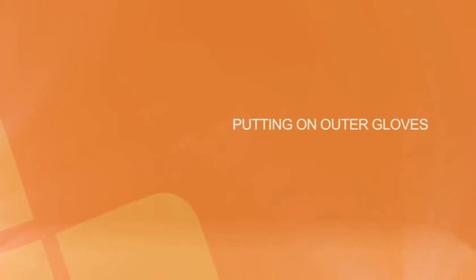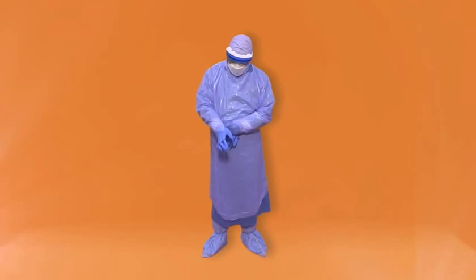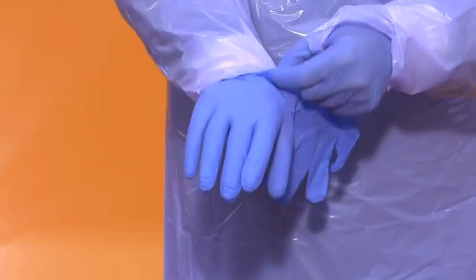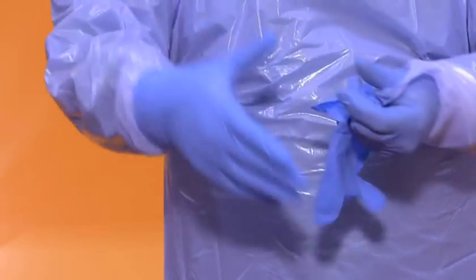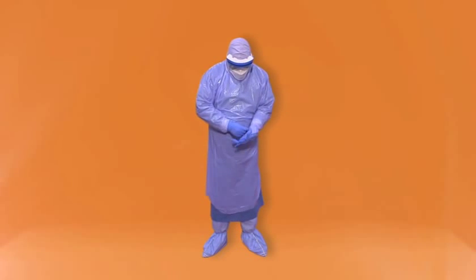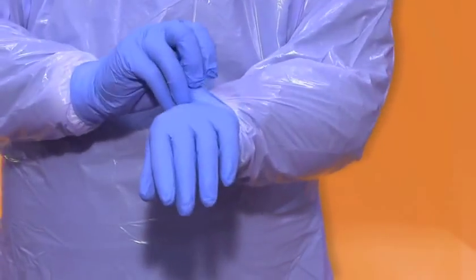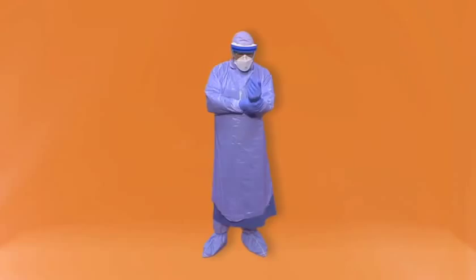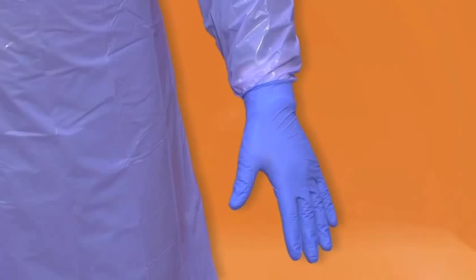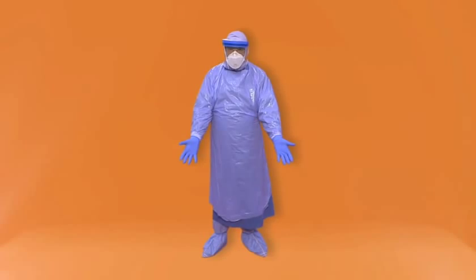Outer gloves. Your outer gloves should also be nitrile and these need to be pulled over the sleeves of your apron and your gown. If you have any breaches in your outer gloves, replace them.